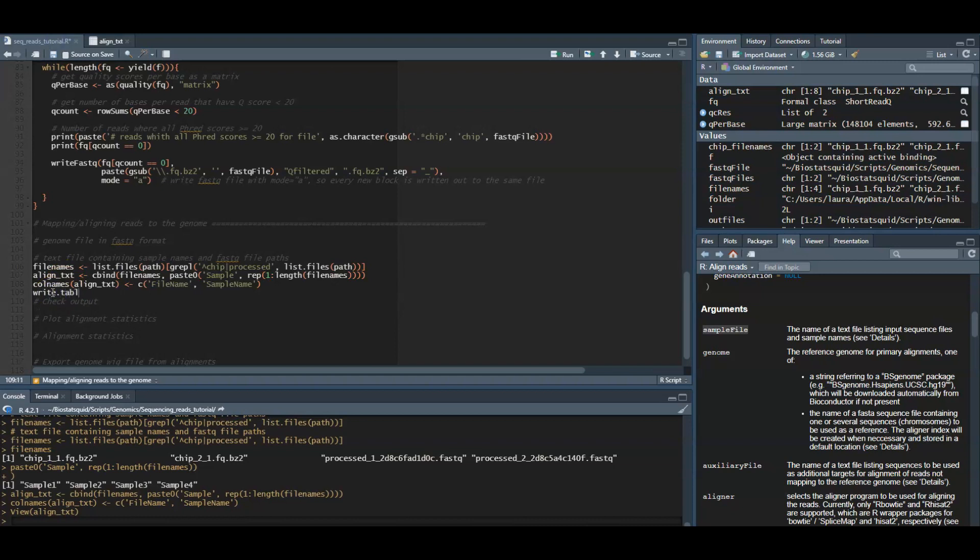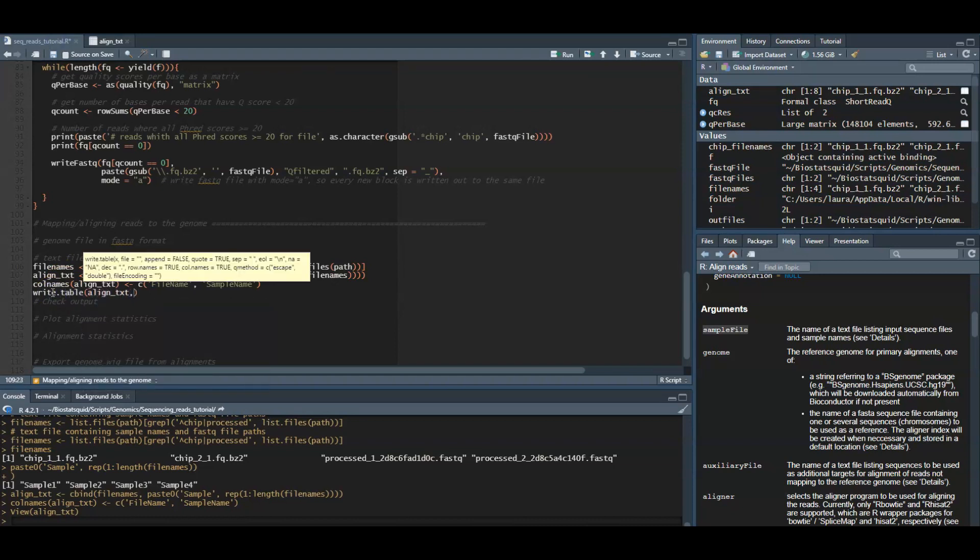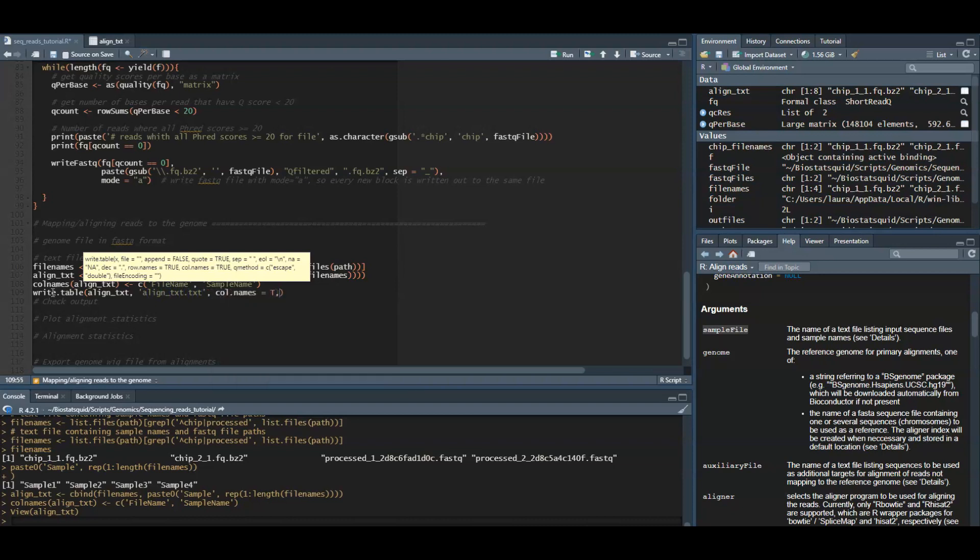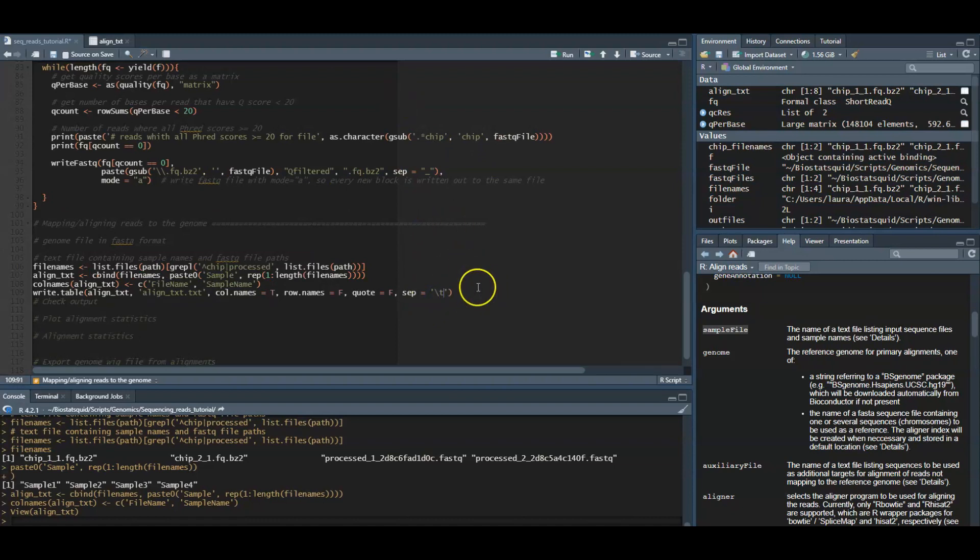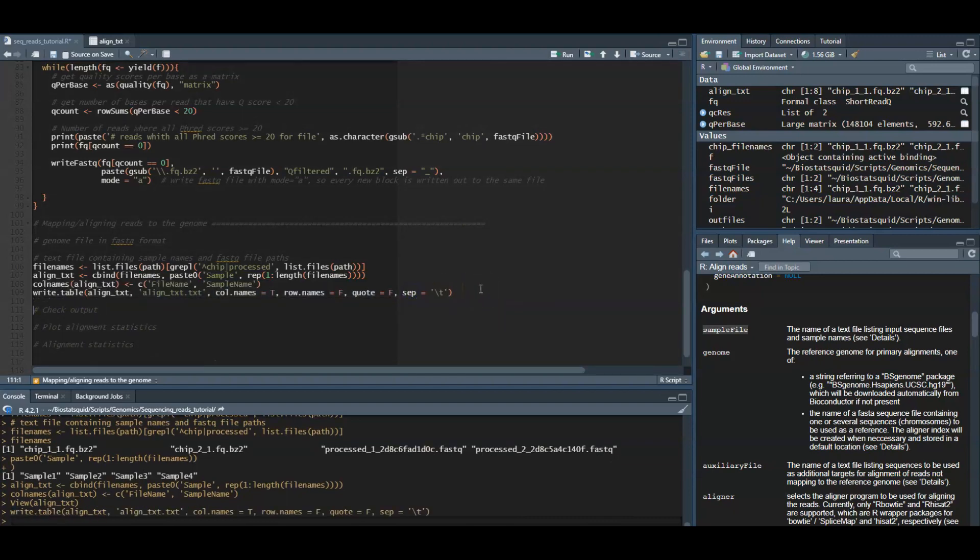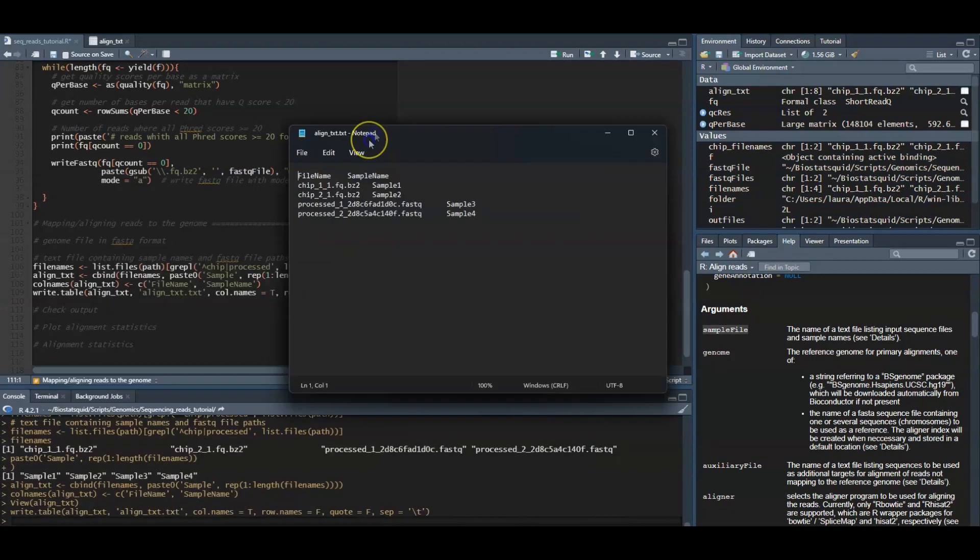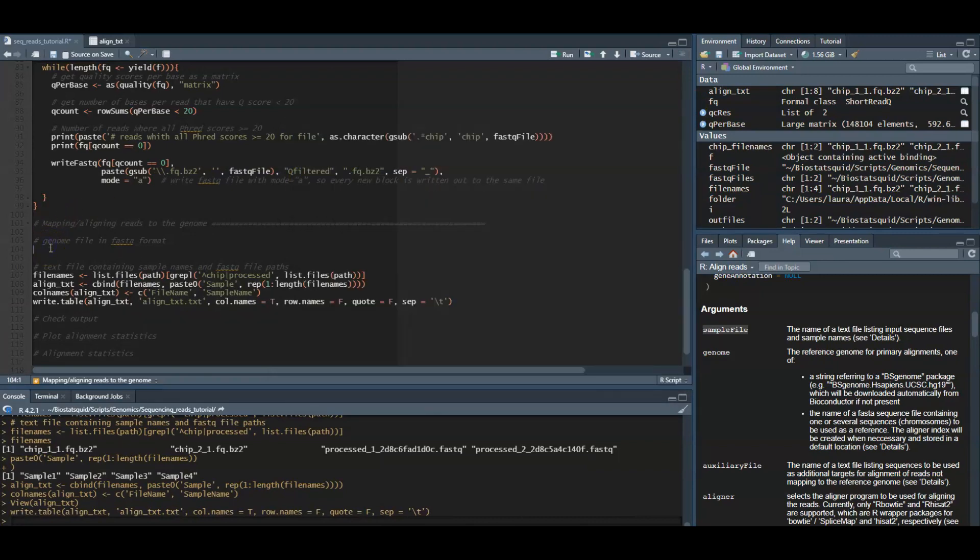So we finally need to write out the table to a tab delimited text file. And these parameters here are essential if you want the align function to work. We want to keep the column names but not the row names. We don't want the elements or different character strings to have quotation marks, and we need to set the separator to this. So now if you go to your original folder, you should see the table.